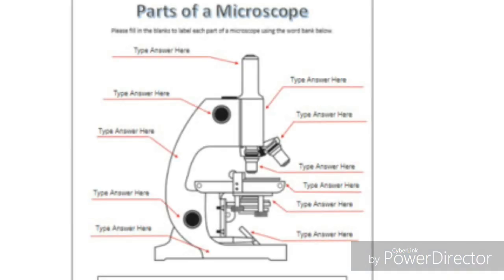Now this glass slide we keep on the platform of the microscope. The cover slip which we kept on the specimen will not allow the specimen to come in contact with the lenses. Now we have to focus light onto the specimen with the help of a mirror which is present below, and we have to adjust the lenses to see the specimen clearly.